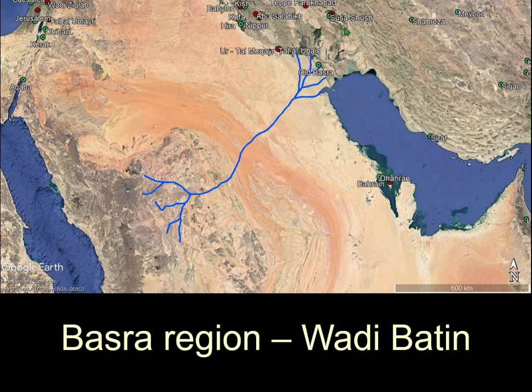Tel Al Ubaid from the sea, that this would have been a delta that looks a bit like, you can imagine what the, which we don't have on the image here, the Nile Delta. And so this is the sediment from the Wadi Batin.